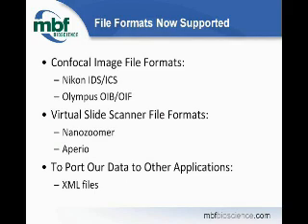With open confocal support, we now have the capacity to read in native confocal image file formats. So we can read in the Nikon IDS and the Olympus OIB file formats. Virtual slide scanners are increasing in popularity, and we want to make sure that if you have that piece of hardware, you can bring in that image data that you've acquired with that slide scanner into Stereo Investigator, Neurolucida, Densita, or Microlucida for data analysis. So if you have a NanoZoomer or an Aperio slide scanner, we can read those file formats.